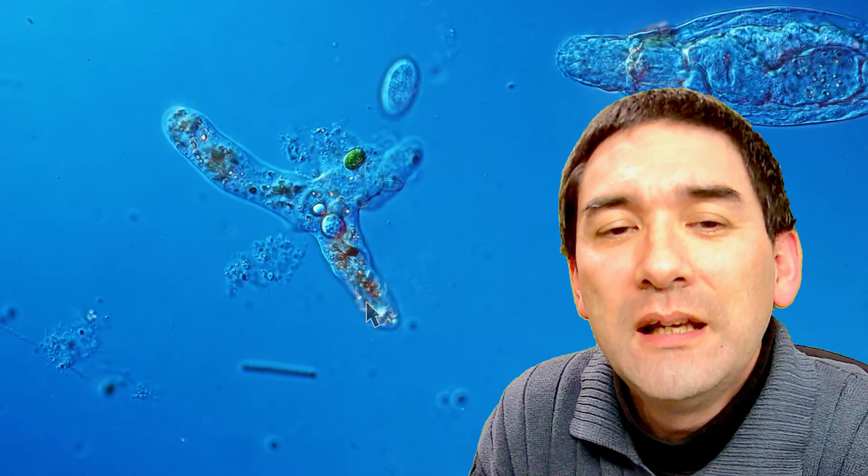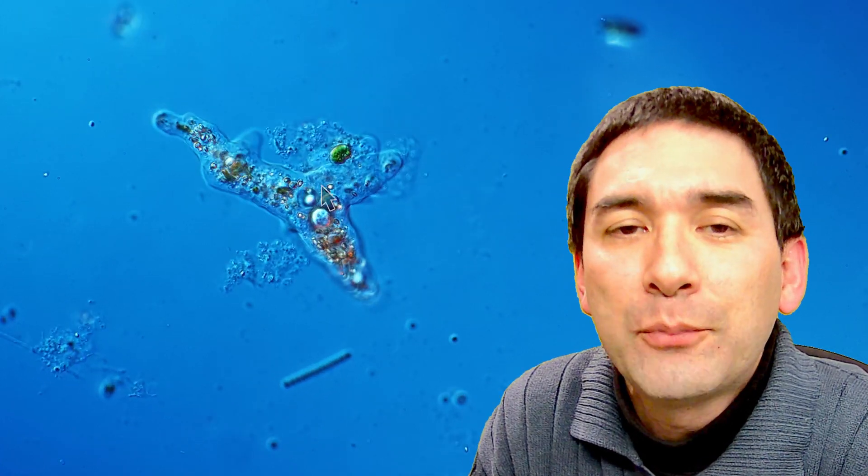So what it does actually is it has those pseudopods, these are the extensions, and it tries to flow around the food that it wants to eat and capture it this way. So in this case over here it tries to capture whatever this is, it's trying to flow around it and then the membrane closes again on the other side and then it has engulfed it.